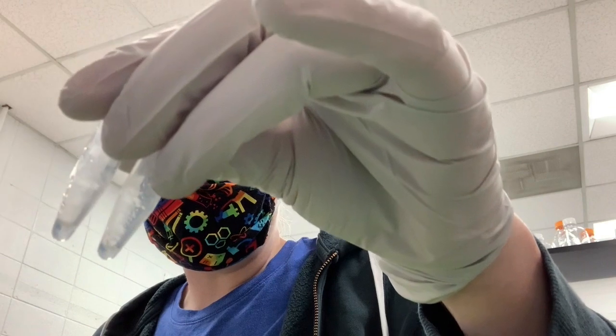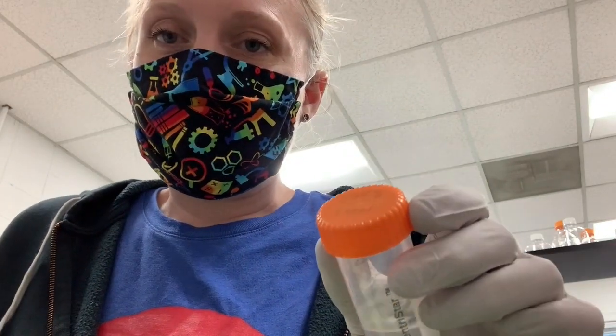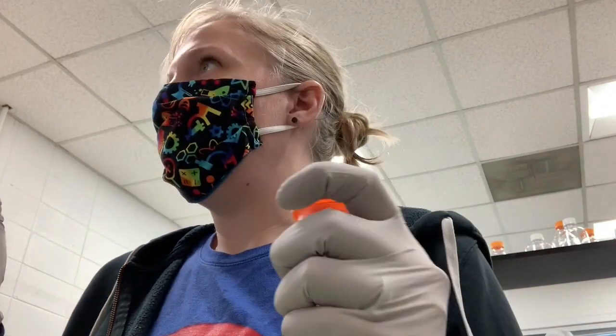Okay, so now I have all of my samples, I have the pellets at the bottom, and there might be a little bit left of our solution, but not a lot. I've gotten rid of as much of it as I could. And I'm going to then, and I was using a separate tip for each tube, you may have noticed, now I'm going to use 70% ethanol, so this is made from the ethanol that we used before, and deionized water or RNase-free water. I'm going to add 500 microliters of 70% ethanol to each tube.